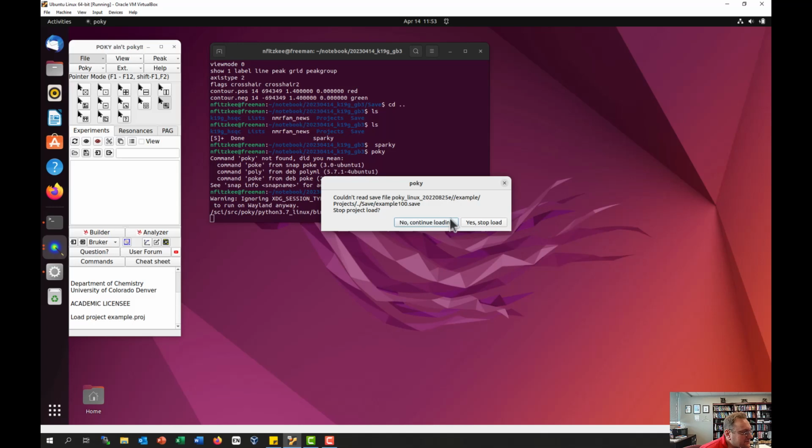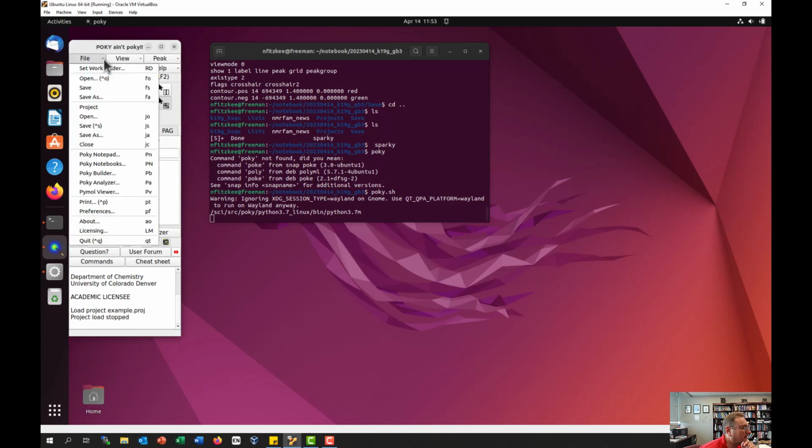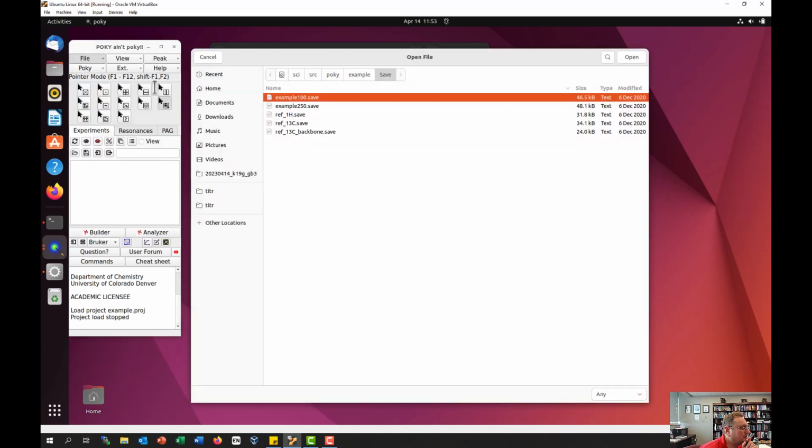Maybe they're not compatible. This is probably a file system thing. Because it looks like it's not reading that file correctly. So let's try to look at open. Oh, and it's writing. So it's looking here. That's probably part of it.